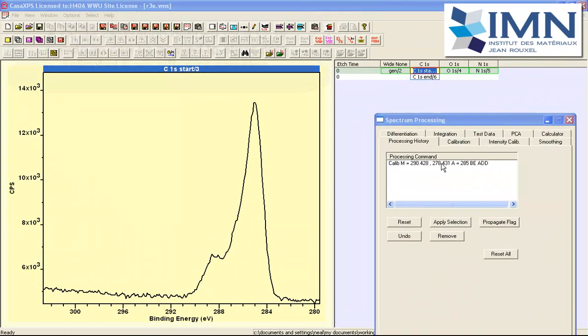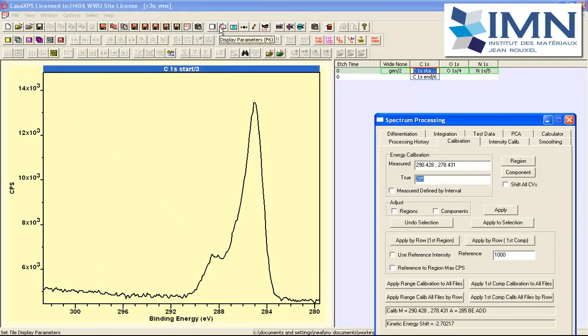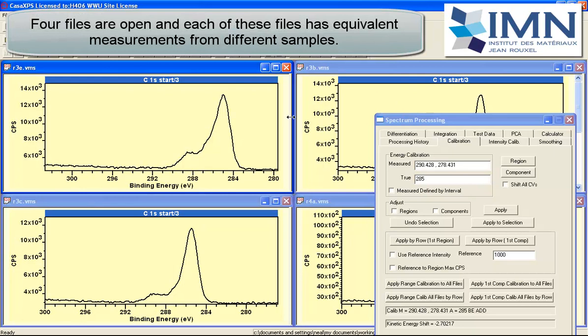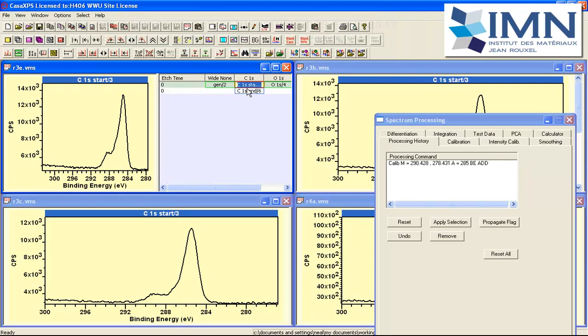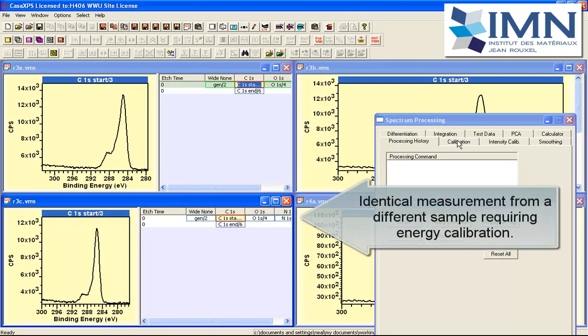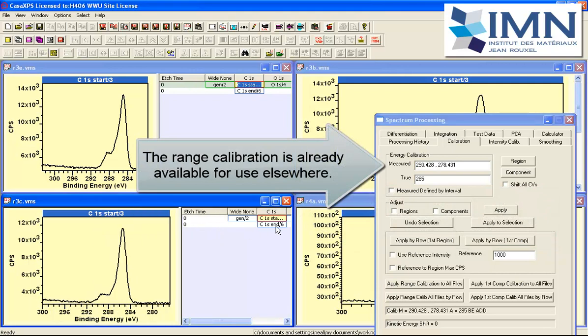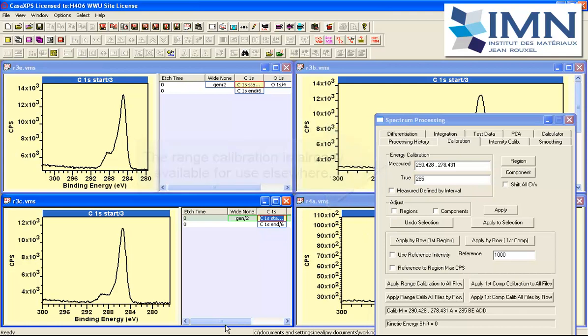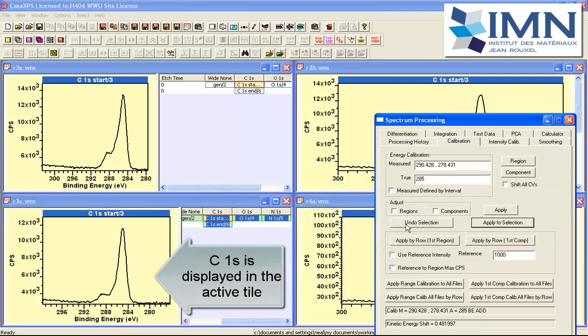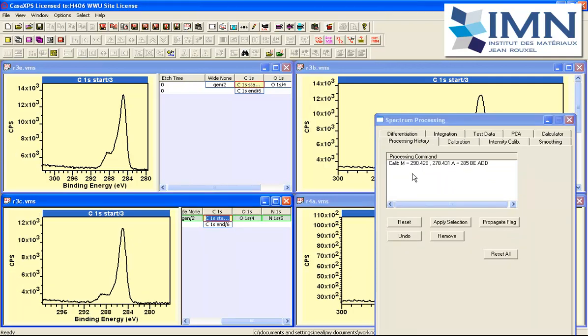One of the advantages of a range calibration is that having defined a range and a true value then we can apply this again to other files if they have similar structure. So I'll tile what's already open and I have four files one of which contains the data set that has already been calibrated. We have others that have a similar requirement. So if I look at this data set here and look at the calibration property page I've already got set up an interval and a true value and assuming that the maximum for this carbon appears within this range and it does look like it does, then if I now select these data and say apply to selection the calibration, then I've now got another file that has got a calibration that is based on the previously defined range calibration that was performed on this first file.